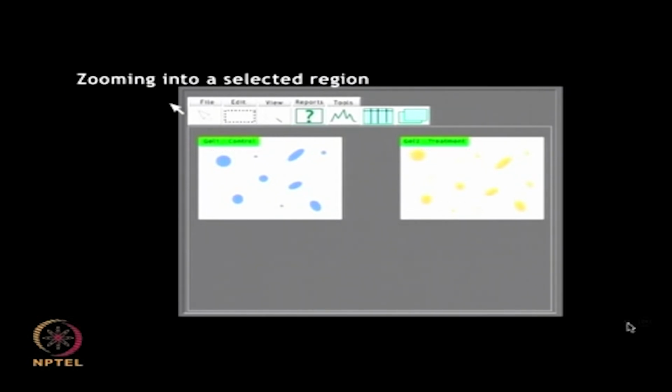You can save the gel images and then you can crop the area depending upon what area you want to analyze. There are several tools which are available for the analysis of gels. It is possible to crop the gels by selecting a specific region that is to be studied and then selecting the crop gel function. Cropping the gel helps in selection of a region with high spot density or to reduce the regions which contain high background stains with no spot.